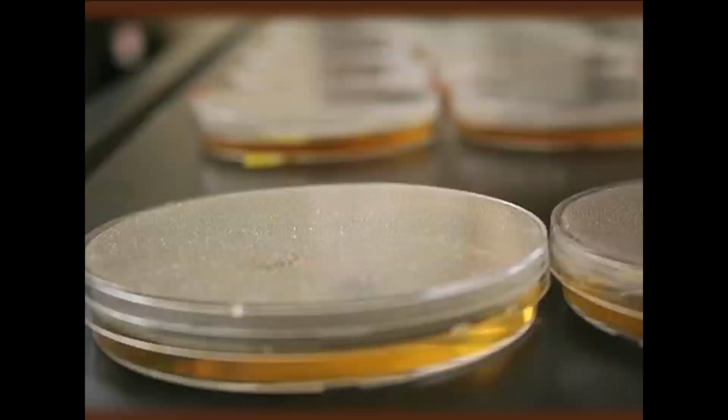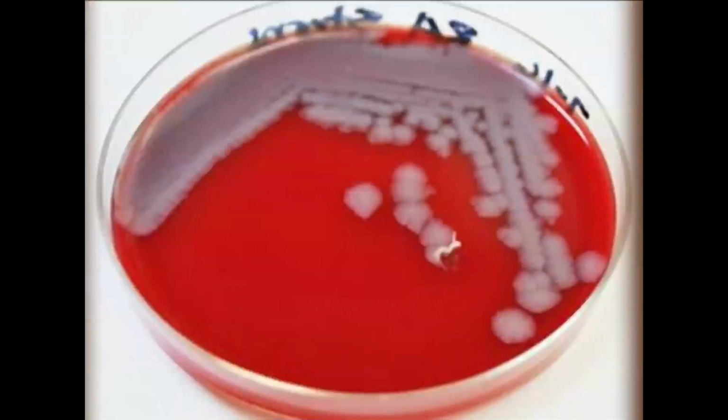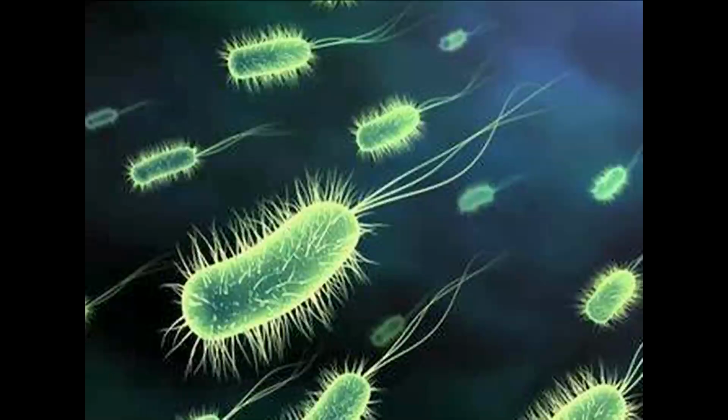Welcome viewers. Today in this session we are going to talk about culture medium. Culture medium plays a very important role in any kind of microbiological studies. Culture medium is generally used for the growth of bacteria under artificial conditions in the laboratory.